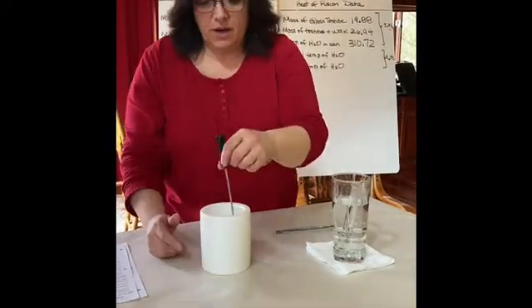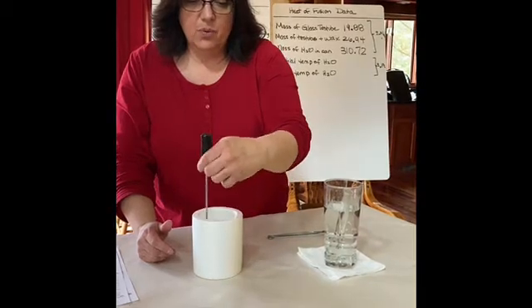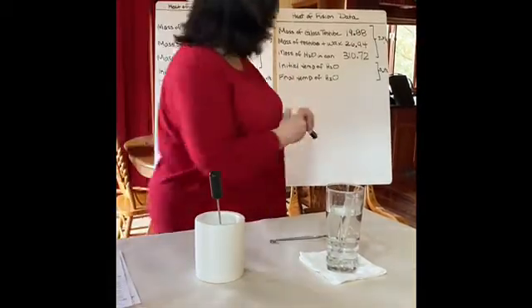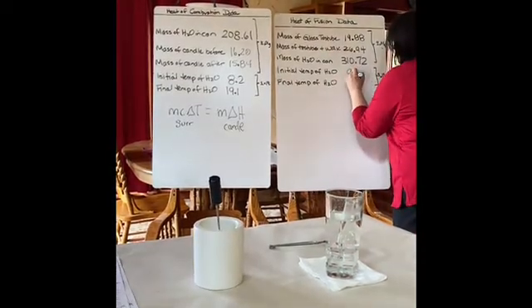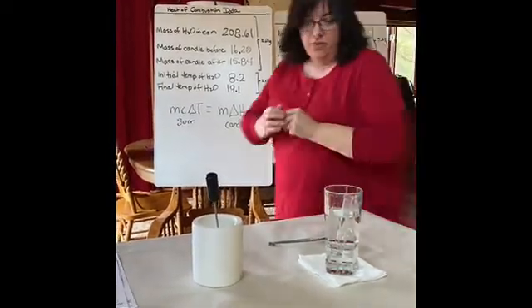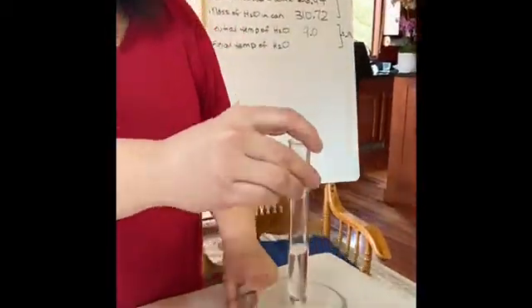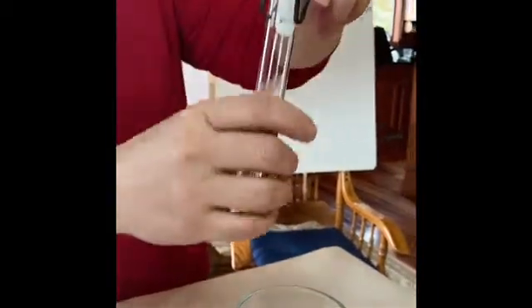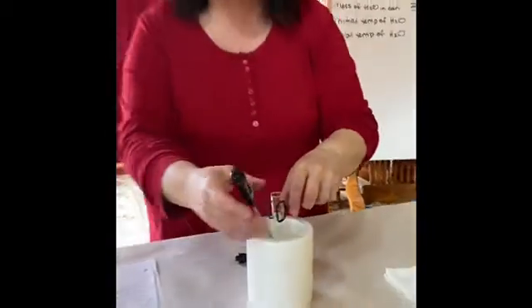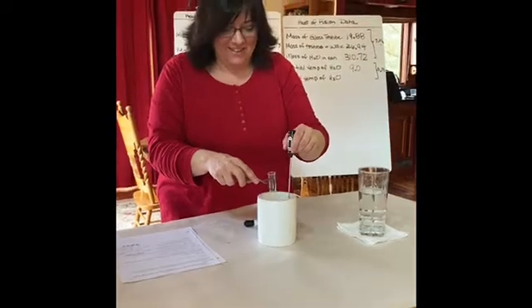So that's what we're looking for. At this point, my cold water is at 9.0 degrees Celsius. So the only thing we need to do is pull the wax out. And like I said, we're gonna keep our eye on it. This shouldn't take too long because it wasn't in there. Yep, there it goes already. Okay, sorry, did you see it? Probably not. I gotta be fast.